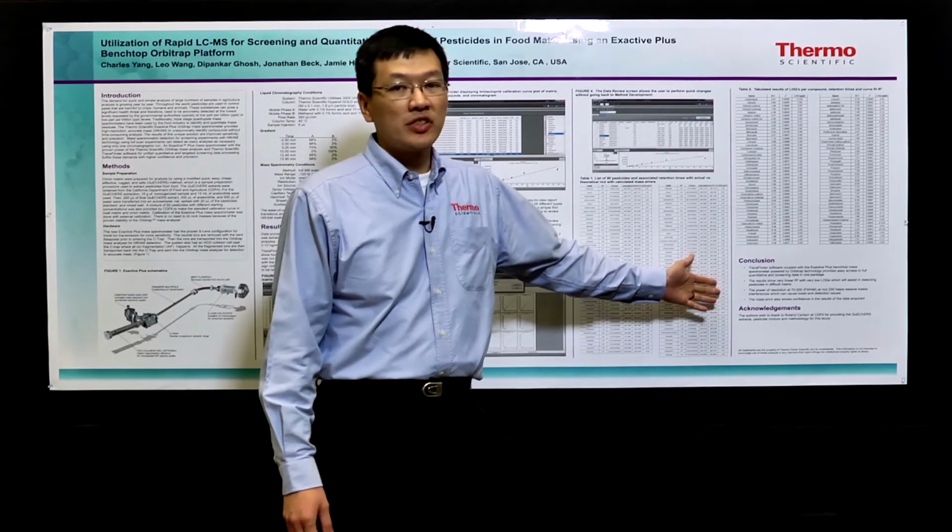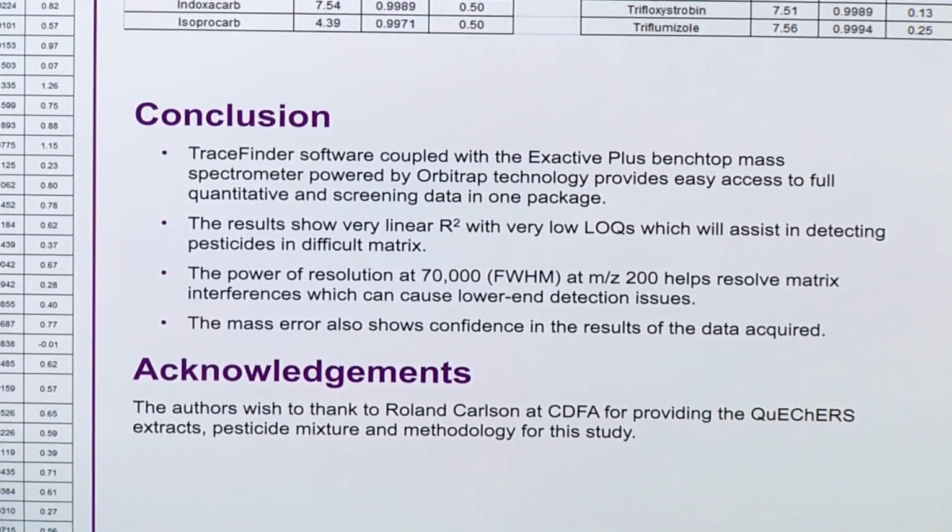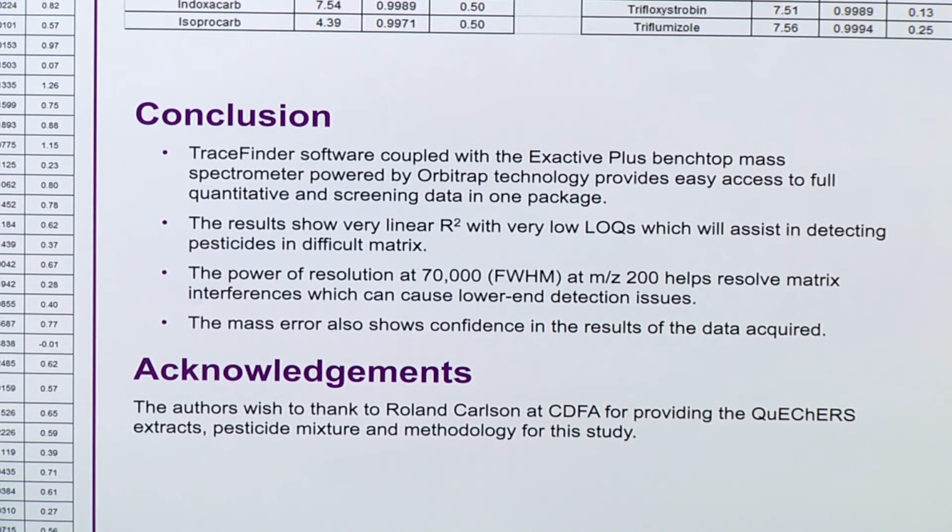In conclusion, what we can show here is that the instrumentation, the Exactive Plus, with the software TraceFinder, can detect all the analytes that you are screening for and targeting against.